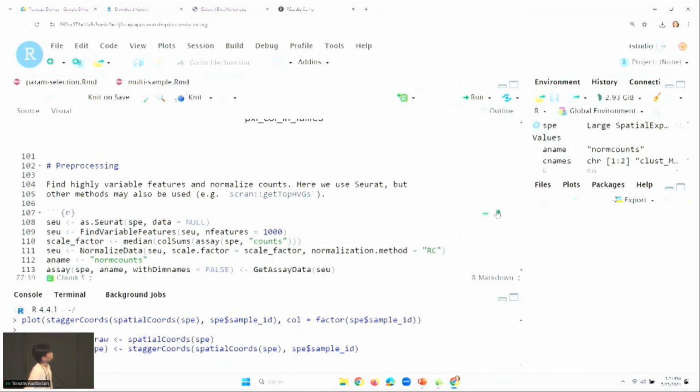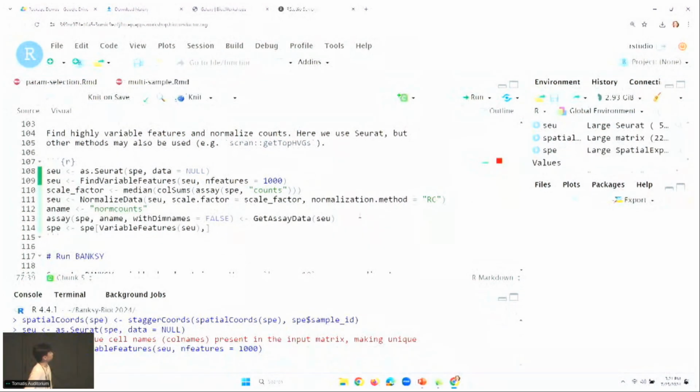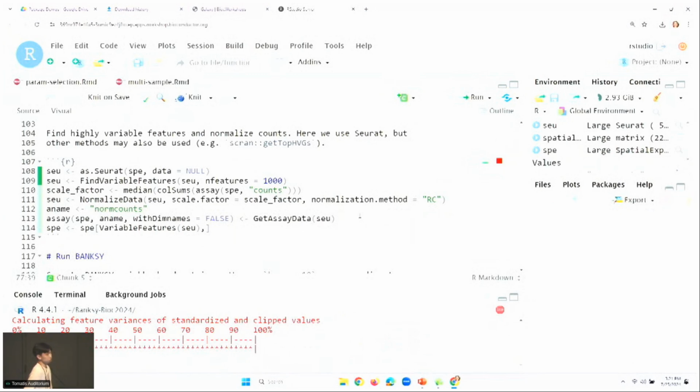Same thing we're going to do, just normalization here. I'm taking some highly variable genes because it's Visium. I think the original data set was like 20,000 features. And for this data set in particular, we found that just using count-based normalization, so normalizing by the library size, works well. Somehow using logs leads to poor performance downstream.